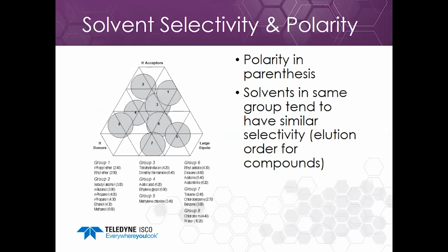The other thing I'm going to talk about briefly is solvent selectivity and polarity. In this list, the polarity is in parenthesis, and depending on if you're running normal phase or reverse phase, for normal phase, the more polar solvent tends to be the stronger solvent. For reverse phase, the more polar solvent tends to be the weaker solvent.